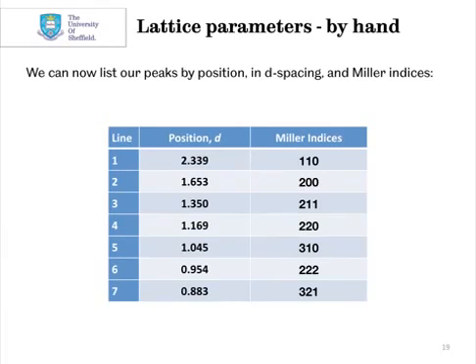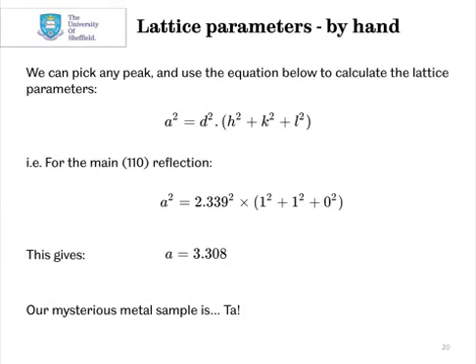Next, we can compare this. We've got our d spacings and our Miller indices for the peaks, and this is all the information that we need to calculate the lattice parameters. We can pick out any peak and use the equation that we derived a second ago to work out the lattice parameters. For example, for a 110 reflection, we found this at a d spacing of 2.339 angstroms, so we can plug those values into the equation, and that gives us a lattice parameter a of 3.308 angstroms. If you remember the possible values we were given earlier, we can now confirm that our mysterious metal sample is in fact tantalum.